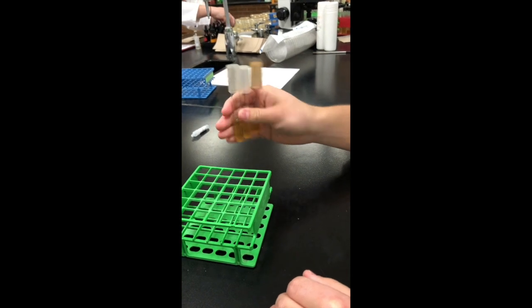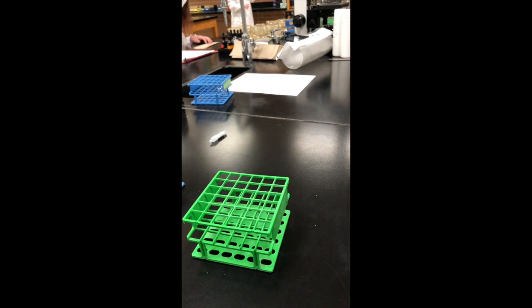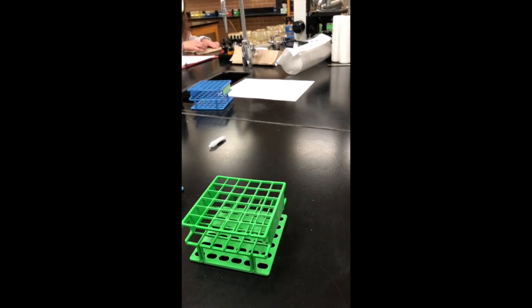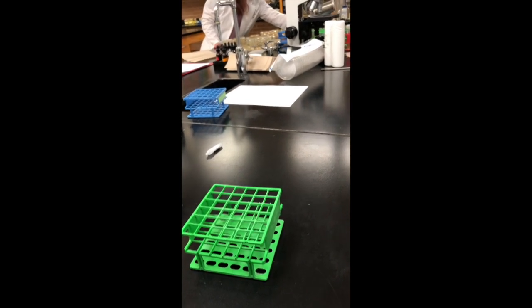Now while Ethan's doing this, we're gonna pause and make another video. Now normally when you're doing this, you do not get up and move from your seat, so just be aware of that. Now we're going to focus on the nitrate test.